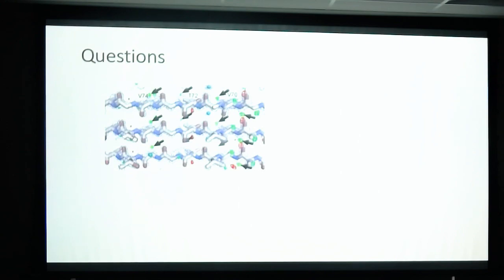If you have a protein that crystallizes but only forms microcrystals, does that suggest a low level of order to the lattice constraints? It might, yeah. The crystals are not very well ordered, but they're ordered well in a small range, and over a large range they can't keep that order. So that's one thing.